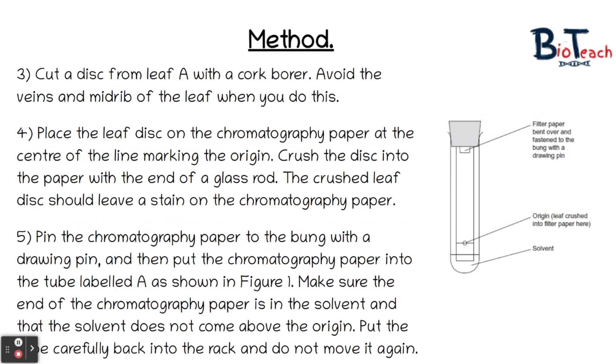You will cut a disc from whichever your leaf A is with a cork borer. You need to avoid the veins and the midrib of the leaf when you do this because there's very little chlorophyll in those areas, so try and do the actual leafy part of the leaf. If you place the leaf disc on the chromatography paper at the centre of the line marking the origin, you can crush the disc onto the paper with the end of a glass rod. The crushed leaf should leave a stain on the chromatography paper. Alternatively, you may want to crush the leaf itself in a pestle and mortar with some solvent and then spot the pigment onto the chromatography origin line.